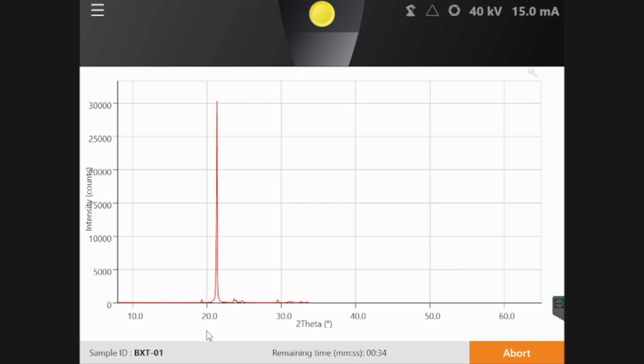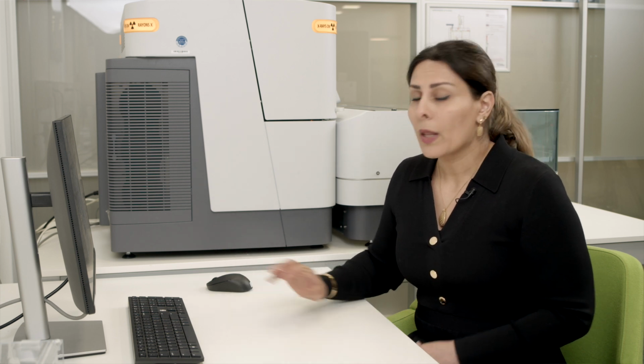I encourage you to picture whatever you're analyzing, different applications, different types of samples, and all sorts of measurements that you prepare can be queued, and you can let the system analyze the whole batch over the night or during the weekend. But additionally, you can also picture that you start a long batch, and all of a sudden there is a priority sample because your production line or process line is waiting for some quick feedback. There is no reason to worry.